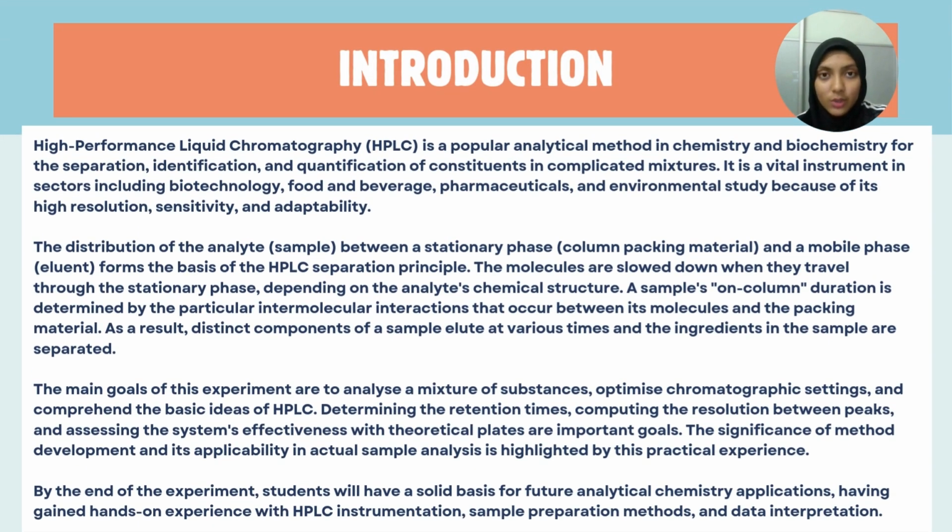So this is the introduction for this experiment. High-performance liquid chromatography, known as HPLC, is a popular analytical method in chemistry and biochemistry for the separation, identification, and quantification of constituents in complicated mixtures. It is a vital instrument in sectors including biotechnology, food and beverages, pharmaceuticals, and environmental study because of its high resolution, sensitivity, and adaptability. The distribution of the analyte sample between a stationary phase, the column packing material, and a mobile phase, the eluent, forms the basis of the HPLC separation principle.